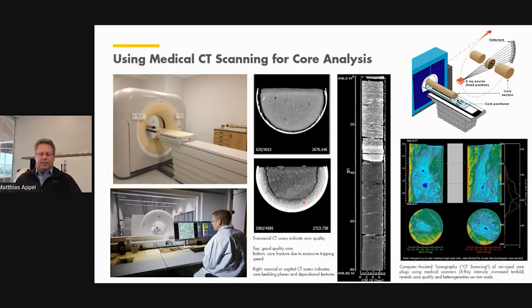Basically, what happens is that, of course, the pore pressure in the core has a certain pressure, quite often a high pressure. And when the core is being pulled out to surface too quickly, and you don't give enough time for that pressure to equalize across the zone of invasion, what you see with the brighter colors, then the core kind of explodes inside the liner, right? And what you see here with the CT scan, within the resolution of the CT scan, is a very strong fracture. What you don't see is a lot of mini fractures, which are simply below the resolution, but which make it very difficult to work with such a core.